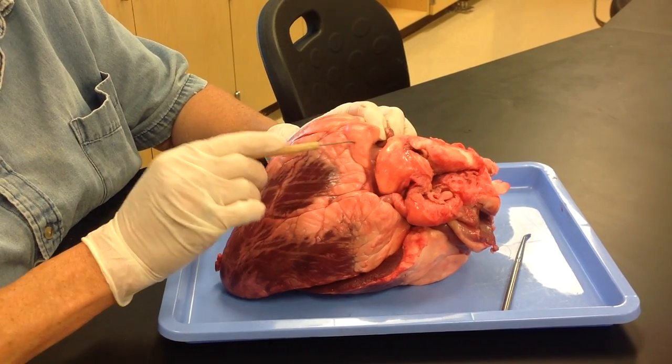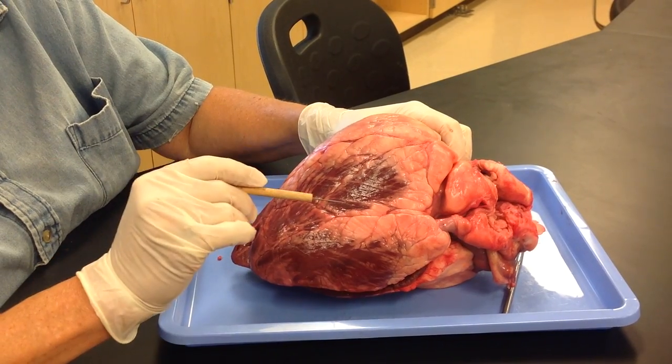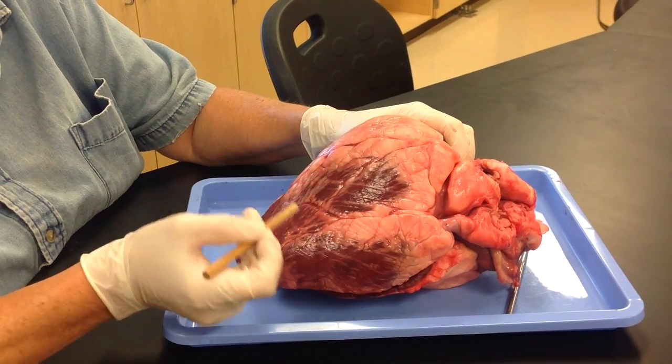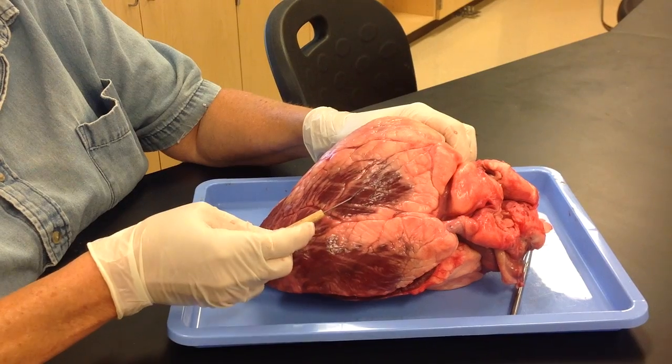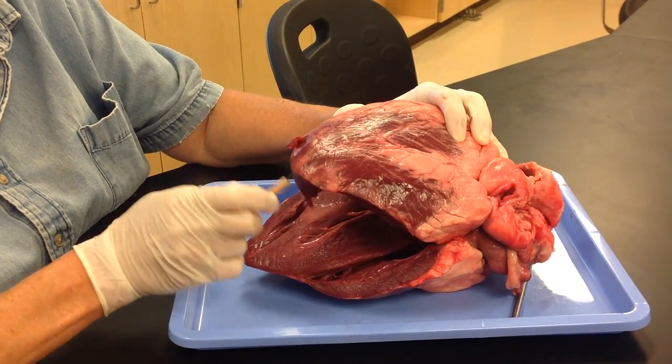Here is a substance called adipose. If we were to point to one of the vessels, you would say coronary vessel. This layer here is the epicardium. This part of the heart is the apex.